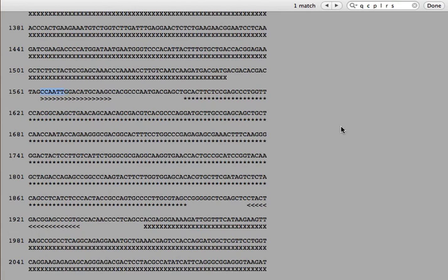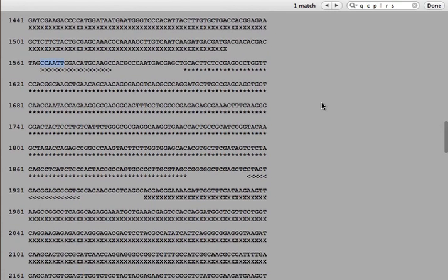So this primer, when you add it to the PCR reaction, would not be binding to this strand of DNA. It would actually, in real life, be binding to the opposite strand of DNA and copying, though, and making this particular sequence. So you have to remember that. DNA is double-stranded. When you make your primers, they have to be on opposite strands or bind to opposite strands of the DNA, which is what this software program is going to accomplish for you. Okay? Hope that makes sense to everybody.